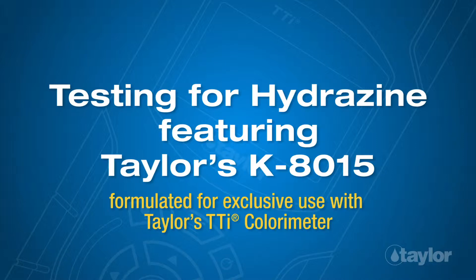Testing for Hydrazine, featuring Taylor's K-8015, formulated for exclusive use with Taylor's TTi colorimeter.